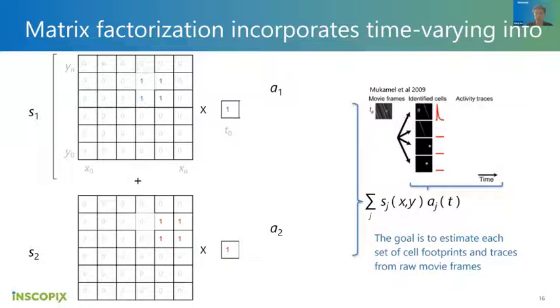At the first frame, it will be contributed only by the active cells or their dendrites, and all those inactive cells, even though they occupy the space, don't contribute to the movie frame. That's really easy if you do have knowledge of the footprint and activity.